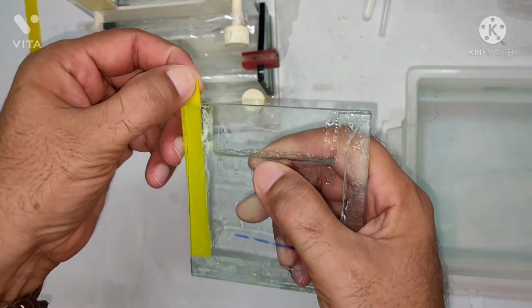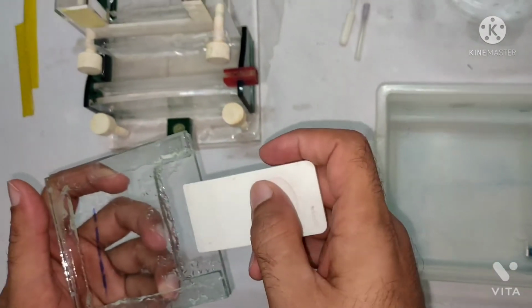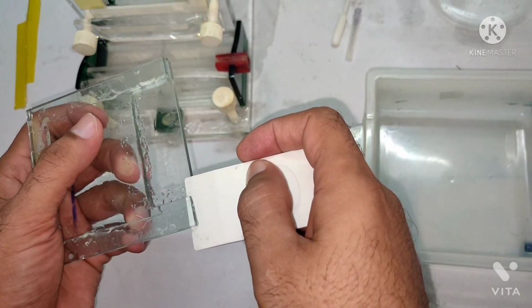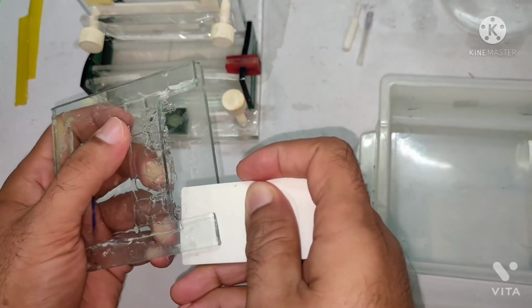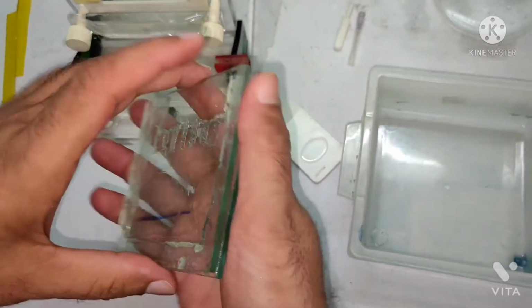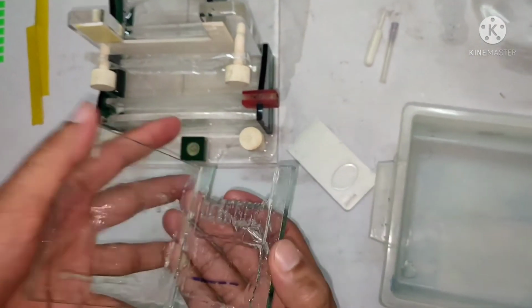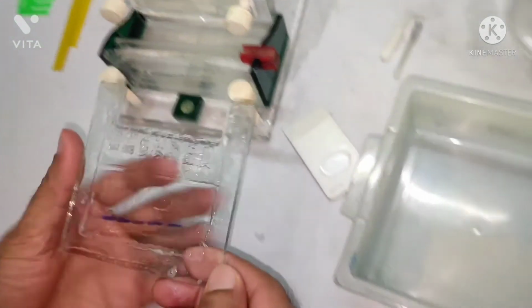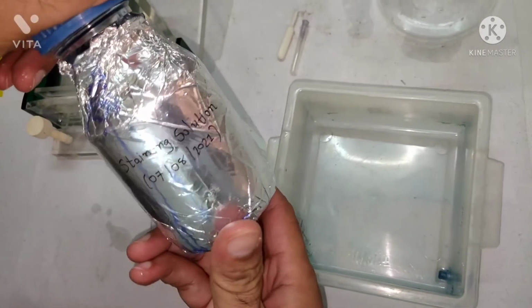Okay, then I am removing the another spacer. Okay, and with the help of this apparatus, this is just the gel remover actually. So I'm removing the plates. Okay, so slowly you can make some pressure, or you can just push inside. Okay, so now this plate, so now be careful so that your gel won't get break. So now this is stuck to this gel. Okay, so I have removed the bigger plate or the complete plate, and now what you do, you just take the staining solution. So this is the staining solution, right?